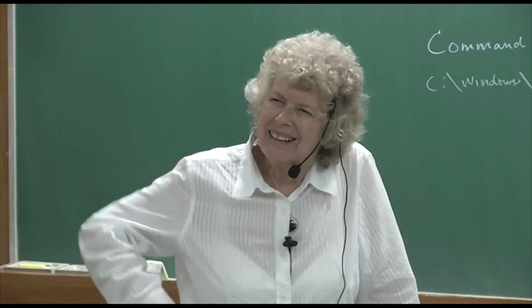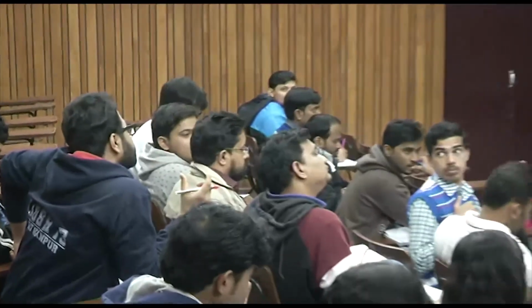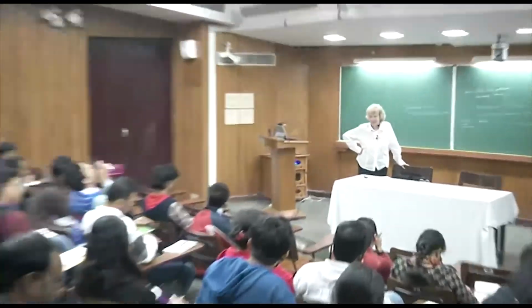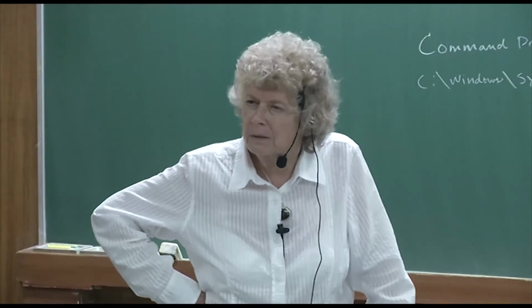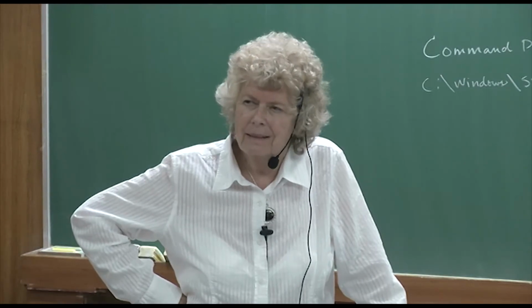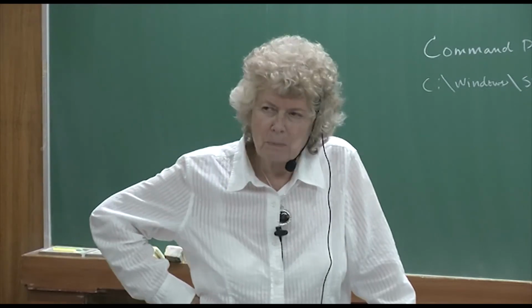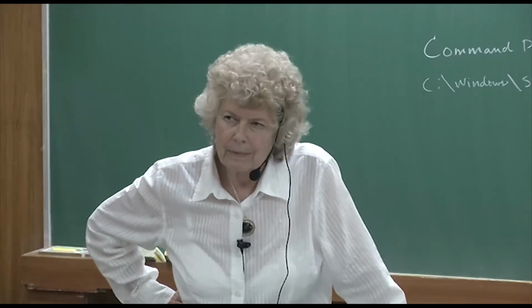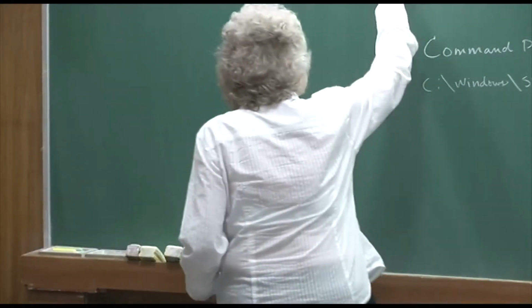Yes? AFIX 66 is designed specifically for benzene. No, FRAG is for whatever you define to be the rigid group. So you decide what the fragment is, and you put in the coordinates for it. So the AFIX 66, it's built in to the software for benzene. Okay, so SADI stands for same distance.